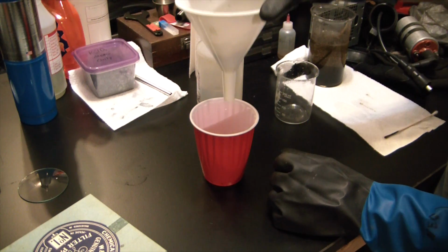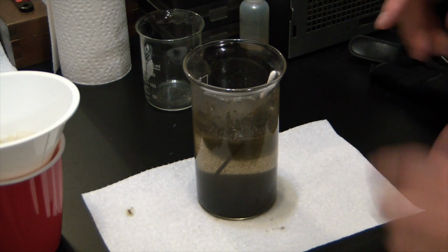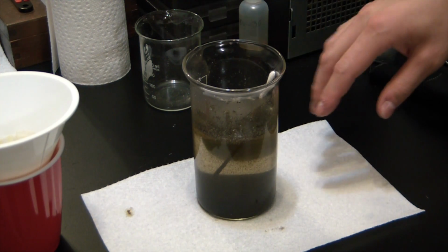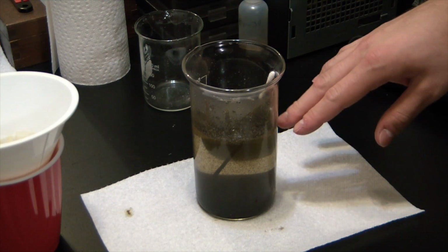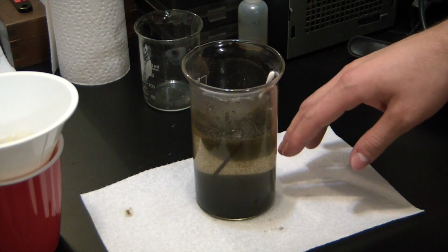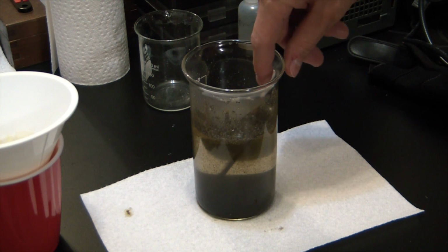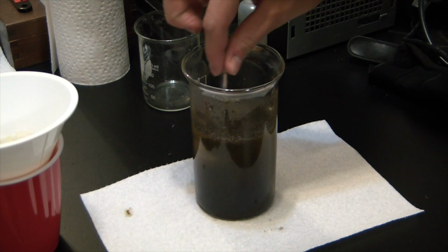Slowly coming through. While I was waiting for the solo cup filter to do its thing, gravity filtration slow as hell, I neutralized the waste solution, which contained copper chloride at that point and some silver chloride, definitely still quite a bit, with the potassium hydroxide, and you can see the black precipitate it formed.